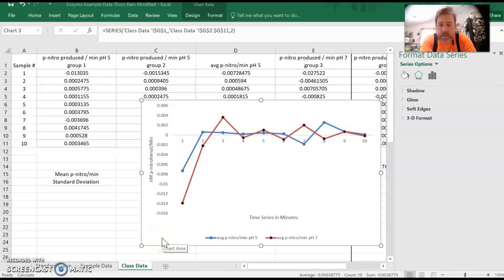Hey everybody, so this is the second video that we are working on your data from the Enzyme lab. So we did the time series, we're looking at that.